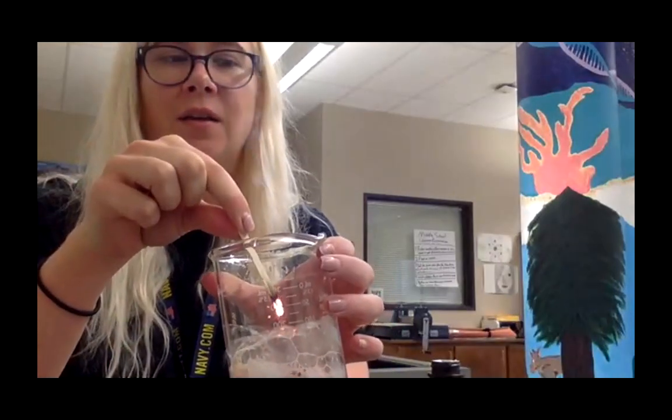So that is how we can actually prove, right? And we could just keep doing that over and over, because the interesting thing about enzymes is that they can get used over and over and over, assuming that you don't kill them by boiling them. So these enzymes are going to keep breaking all that hydrogen peroxide down until there's absolutely none left, right?